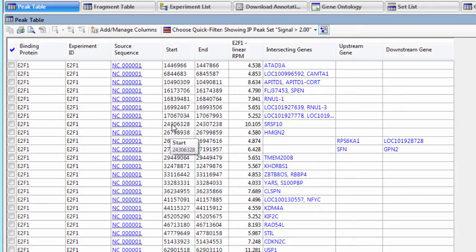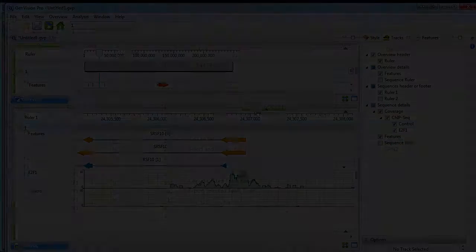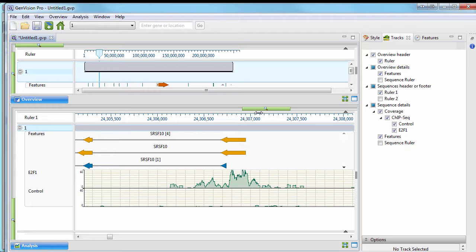You can then visualize peaks in GenVision Pro. You can also combine the results with RNA-seq data in SeqManEngine for combined gene expression and regulation analysis in both ArrayStar and GenVision Pro.